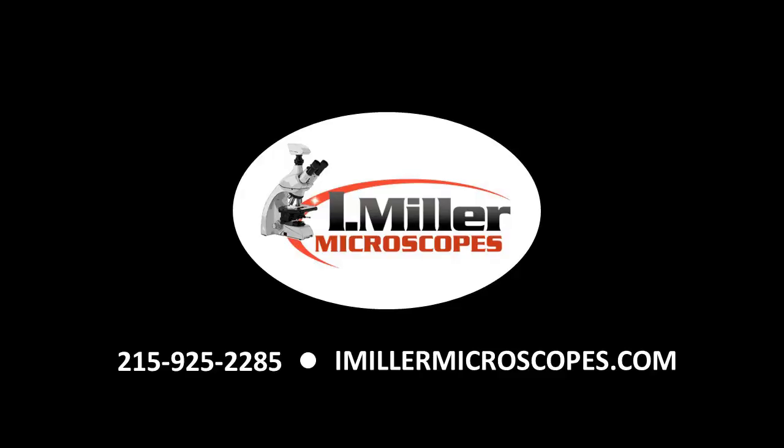That's how you mount the C-mount camera to your microscope. If you have any questions, please give us a call at 215-925-2285 or visit us online at imillermicroscopes.com.